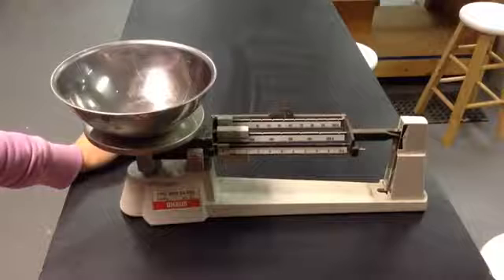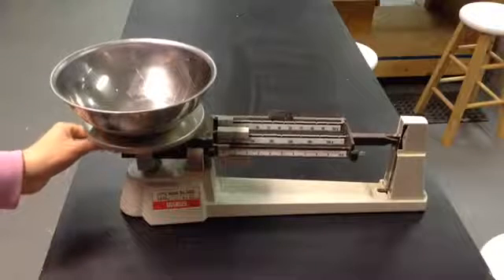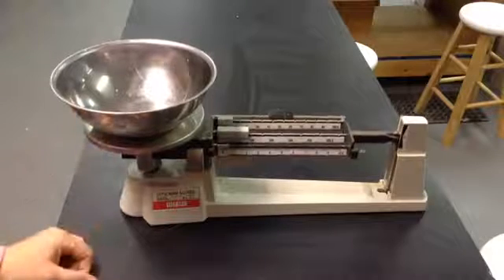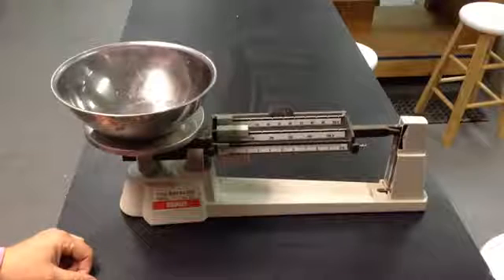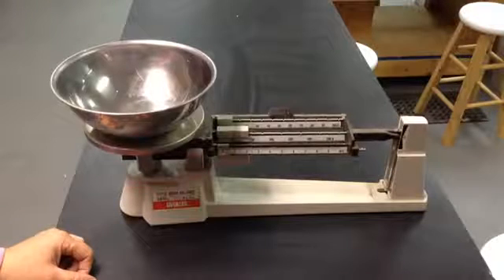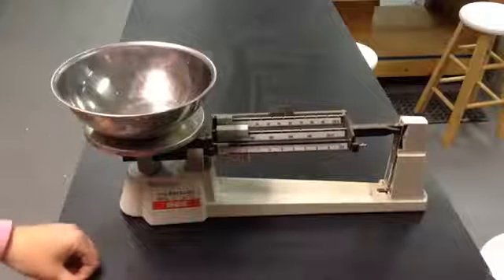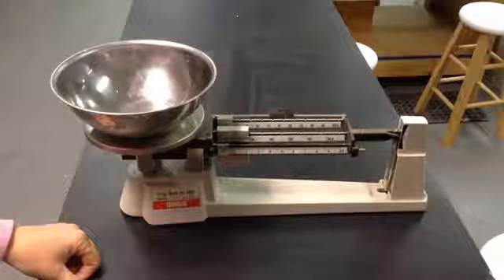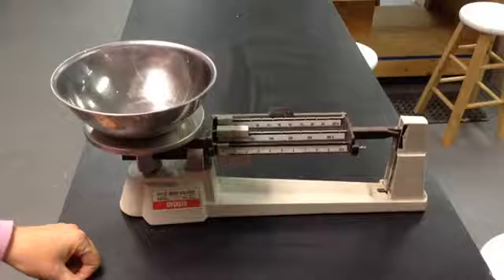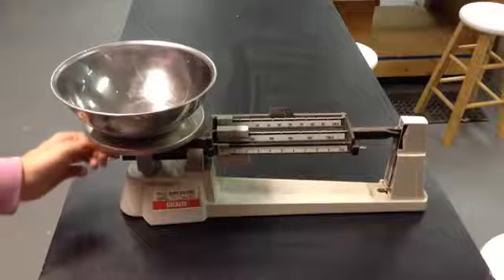When you begin to get close to the zero, you can use the fine-tuning adjustment knob beneath the pan to continue to get closer and closer to zero. Take your time and wait for the beam to stop moving in order to tell how close to zero you have gotten.